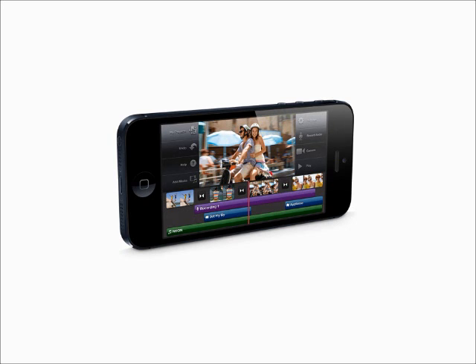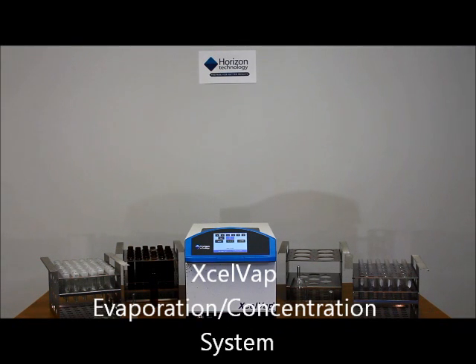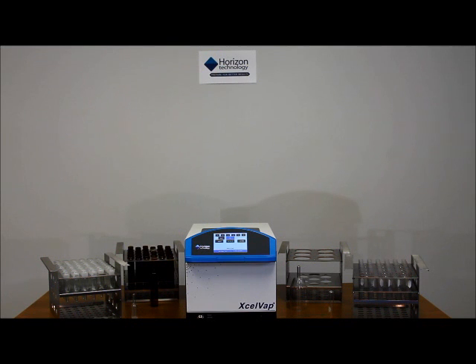Which would you rather have, old or new? The newest addition to the product line for evaporation or concentration of sample extracts is the ExcelVap system. This is a modern system incorporating the newest technologies for evaporation with a heated bath and nitrogen blowdown.